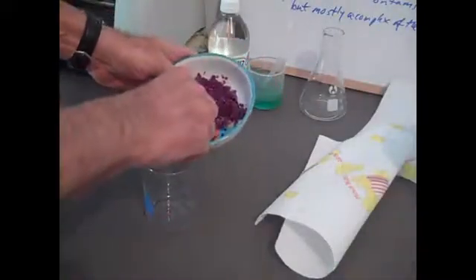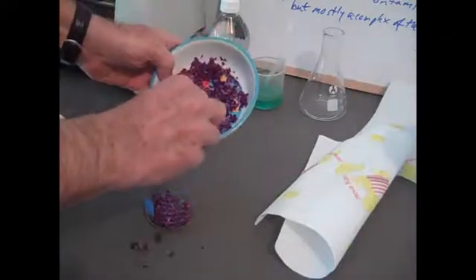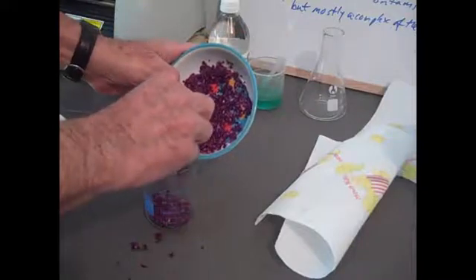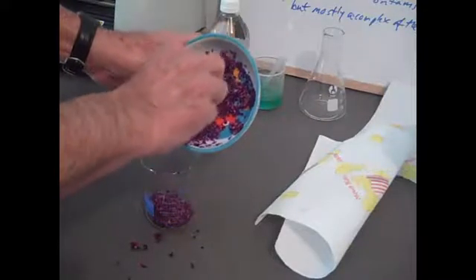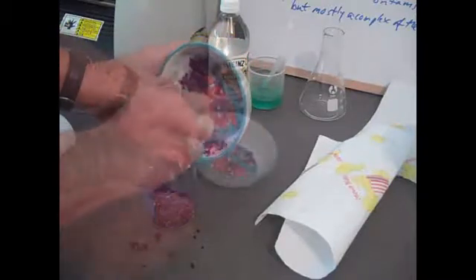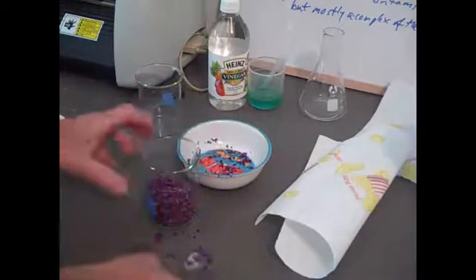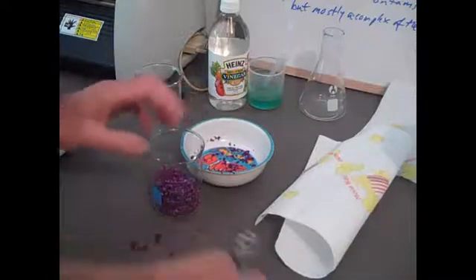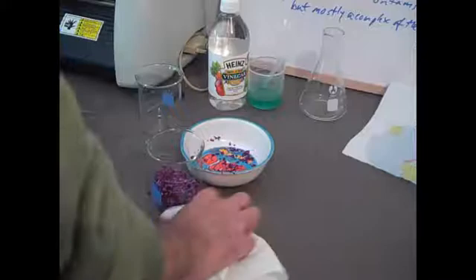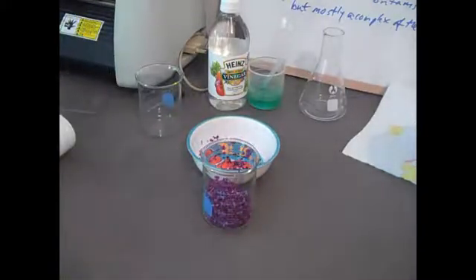Here we are with some finely chopped red cabbage leaves, which we made in the vegetable blender. We're transferring them from a saucer into a beaker where we can add some hot water and try to extract the pH-sensitive dye. There's a pigment in the red cabbage leaves that is sensitive to acids and bases, and we want to get that out and use it.